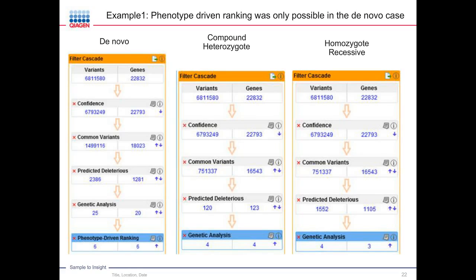Like in this case, for example, we don't know what is causing the disease. So we think it's not dominantly inherited. At least that would be the last one we would choose, because we know that the parents don't have symptoms. So we look for these 3 cases, and for compound heterozygote and homozygote recessive, these 2 scenarios, the variants here are not explaining any of the phenotypes.